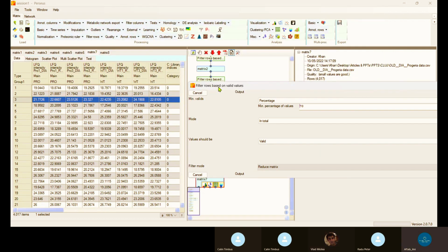In this case, we are working with hybrid data, because it may be possible that in a disease sample the proteins are expressed, but in the wild type they are not expressed. So this is also an imputation challenge nowadays. In our AD data, we used male and female data. We found that some proteins are expressed in male data but not in female data. If we imputed them, then we lost the significance. We can't say that in the Alzheimer data these proteins are overexpressed in male samples but not in female. So this is also a challenge.